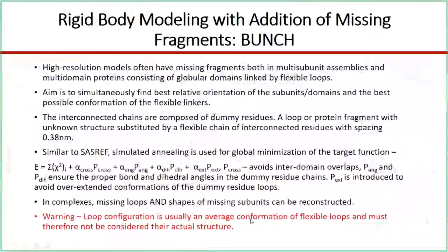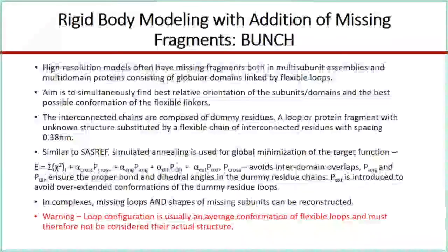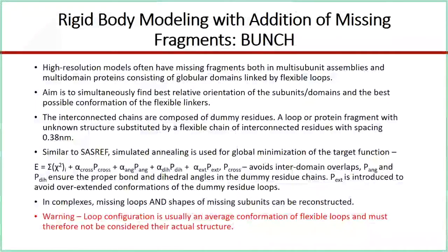One thing is the approaches for SASREF and BUNCH are now combined in this other program called CORAL. I've unfortunately not put a slide for it. CORAL stands for complexes and random linkers. It basically uses a library of random chains ranging in length from around 5 to 200 amino acids.